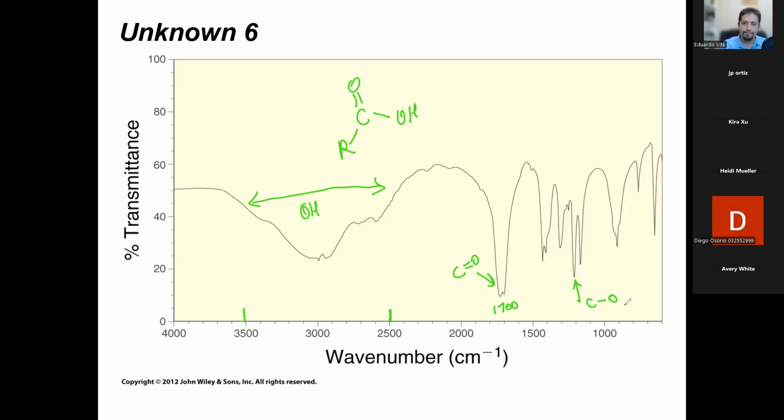Does that make sense? So yeah, in this case, the spectra is not the best looking, but you still got to be able to read them even if they're not the best. You can just imagine that the baseline starts here and pretend that you're looking at it. It's relative, right? That's what I'm saying. You have to look more at the shape, more at where they are. How do they look? Not, oh well, I didn't know it was a carbonyl because it was at 1850. Maybe the instrument is off. If you know what a carbonyl signal looks like, you should be able to reasonably guess that it's a carbonyl, even if the spectra is not the best looking spectra.